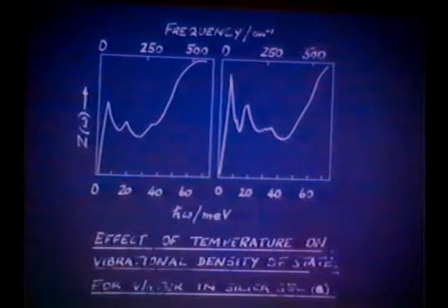And we've done other work subsequent to this, where we have much smaller pores, where we've sorbed water into the pores and looked at the translational diffusion constants, and also looked at the inelastic region. In that case, we just see no formation of ice at all. So it seems that the pore space does determine whether or not one can form this long-range hydrogen bonded structure in ice. So we're concluding here.